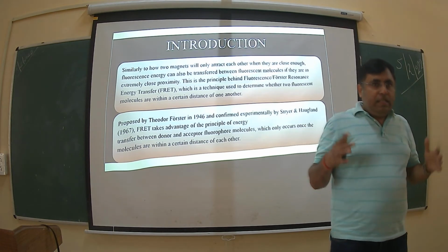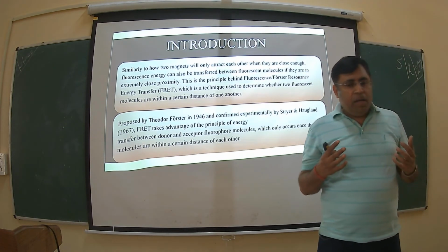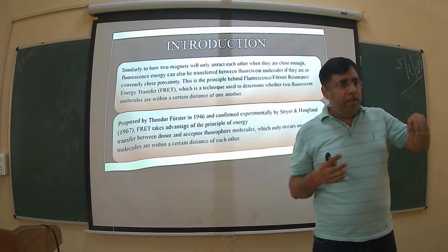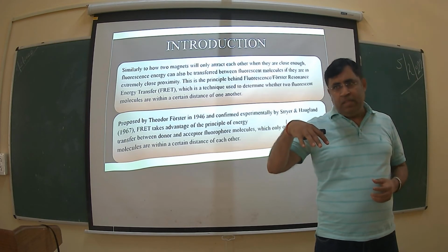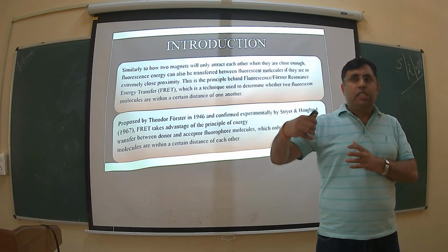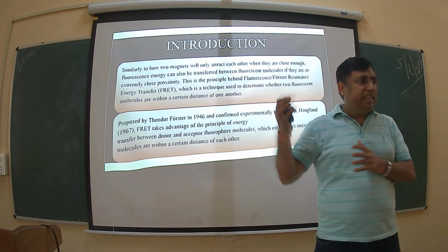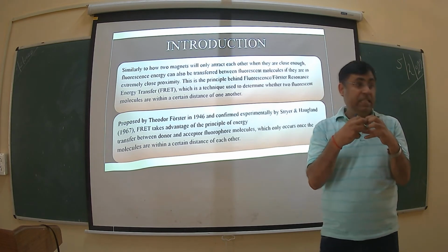Let's say I tag protein A with some dye, I tag protein B with a certain dye, and then you see that protein B is emitting the fluorescent signal. Then you will understand that protein A and B are in close proximity.